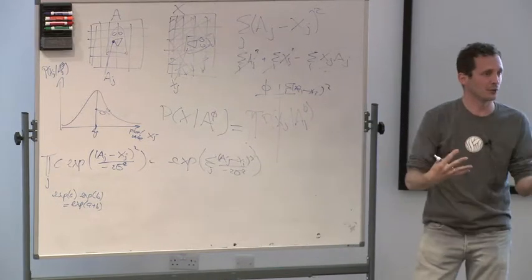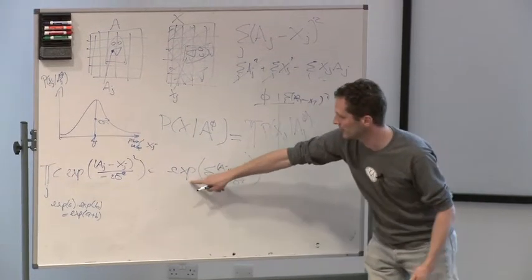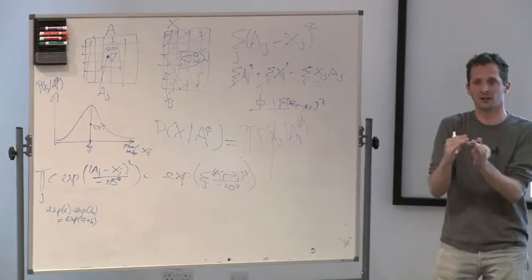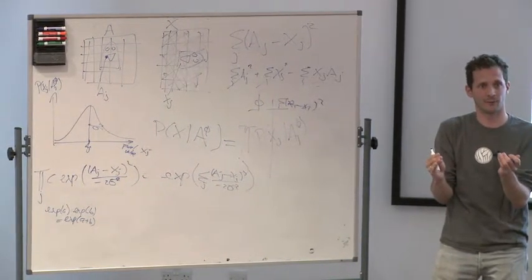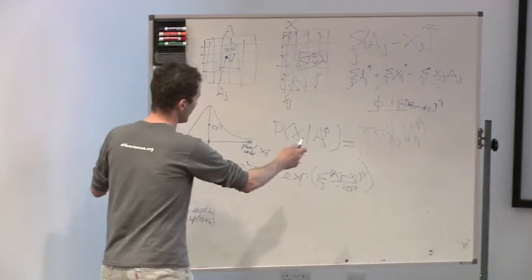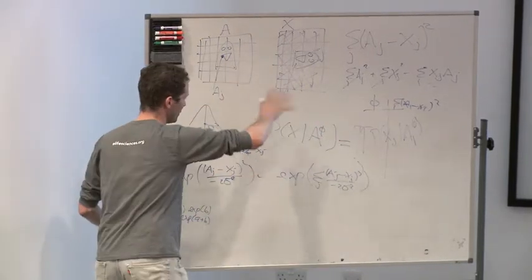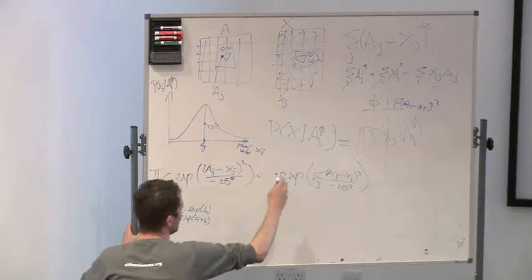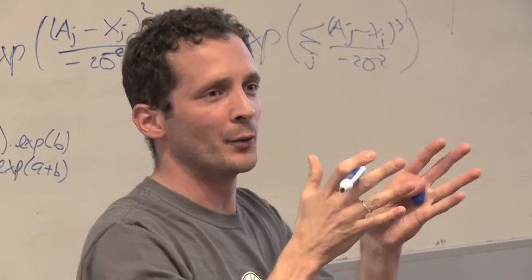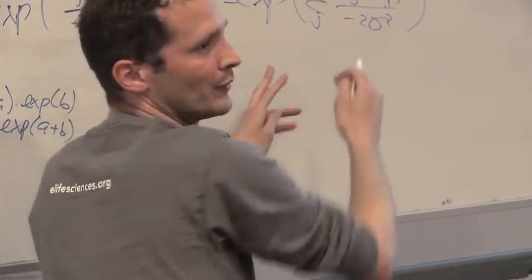There's some additional stuff around it, which is this division by the standard deviation of the noise, and it's being exponentiated. But the underlying similarity measure is actually rather similar. Okay. Now, what you then do in maximum likelihood is that, let's assume we know all the phi's for now, all the orientations of the penguins. Okay. If you would do, then the probability of observing all the images, if observing one image is independent from observing the other images, you can then multiply again over all these. Okay.